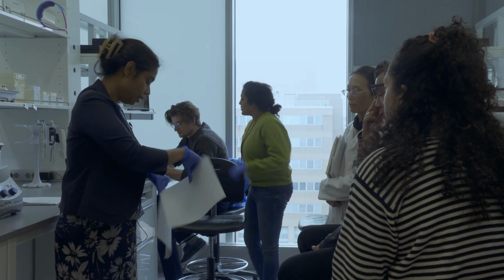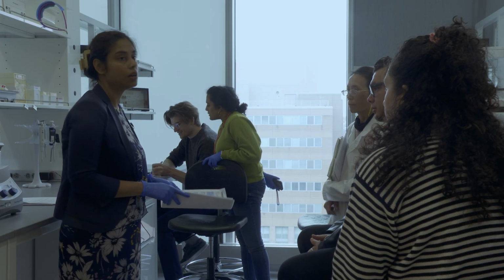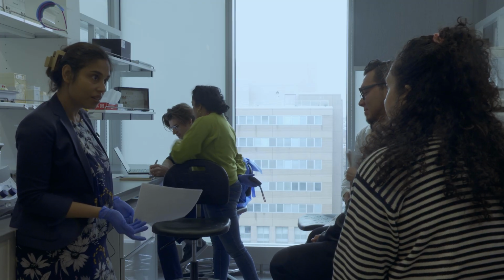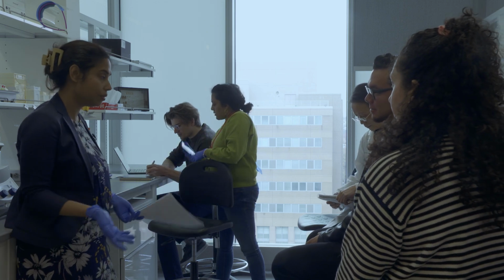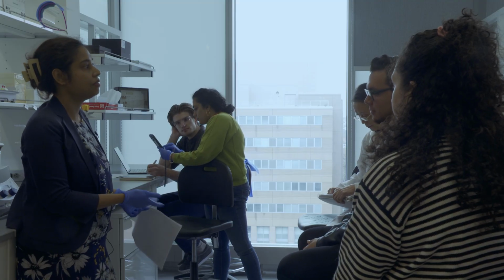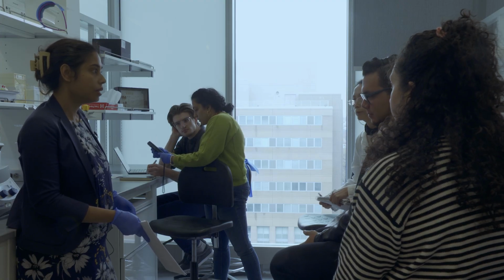Yeah. Okay. So I think at least right now, my understanding is that sample prep is very important, right? Because you are not dealing with a very straightforward kind of sample. So optimization of which purification method for the cfDNA works best, I think that optimization is very important.